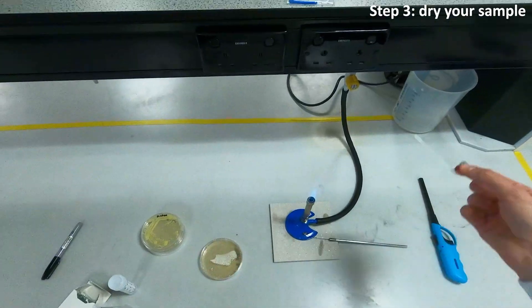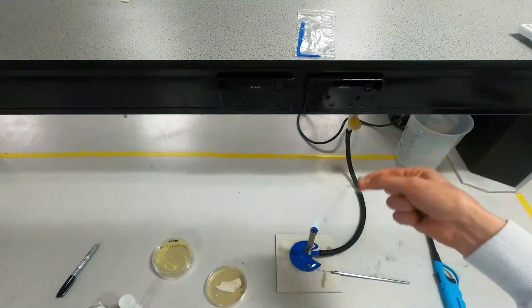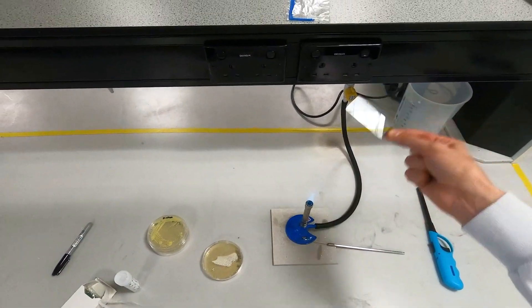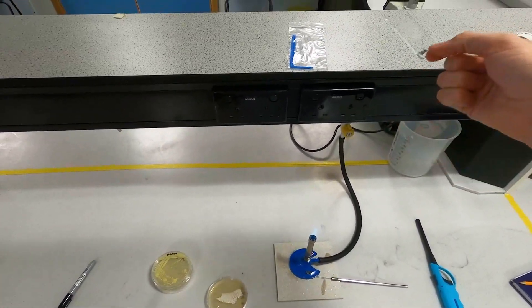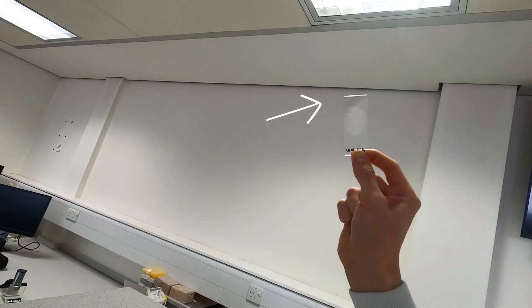Now you're going to use the Bunsen burner to heat up your slide just a little bit to evaporate the water off, but you don't want to get it too close or it'll thermally lyse your sample. Once your sample is dry it should look kind of cloudy white and slightly opaque, something like that.